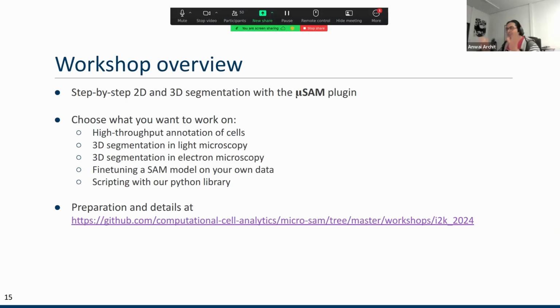Now, all being said, what is the workshop overview right now? I'll give you a few examples and you can choose what to work on. Since I didn't communicate this well before, what I mean by work here is, you can ask me questions, we can do things together, we can brainstorm, chit chat.